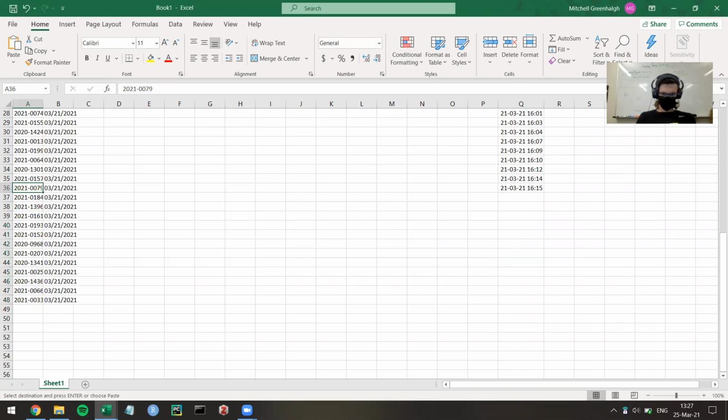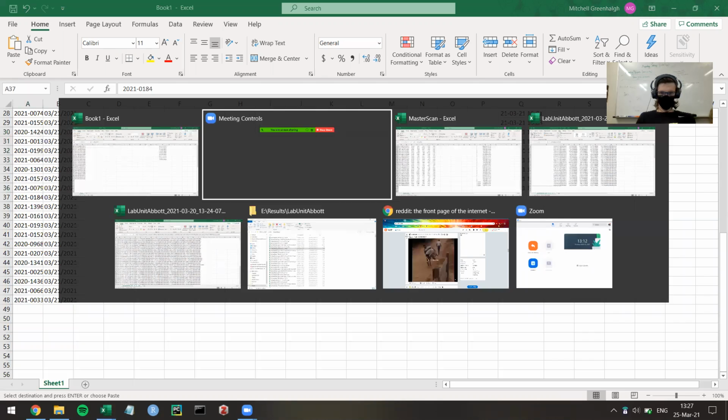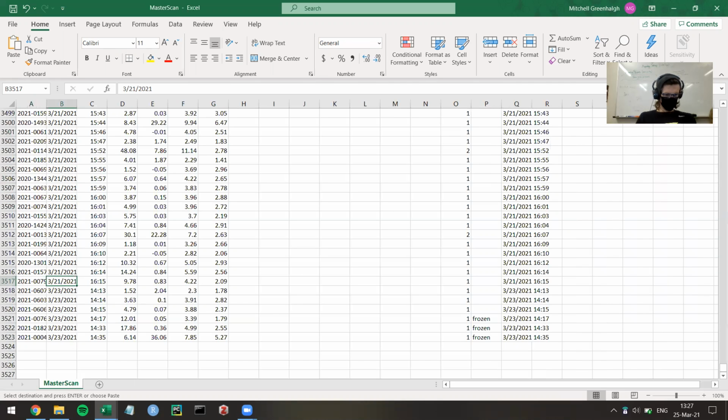So if we go 2, 3, 4, 5, 6, 7. No, we need to go to MasterScan. So 21st, 1, 2, 3, 4, 5, 6, 7, 8, 9, 10, 11, 12. These were all also brought over.